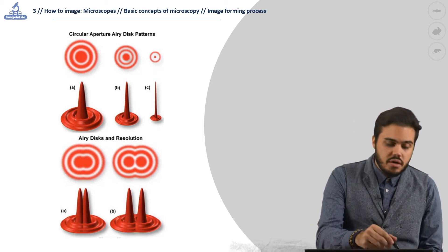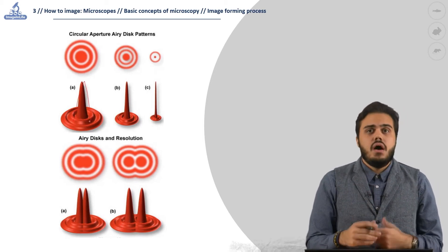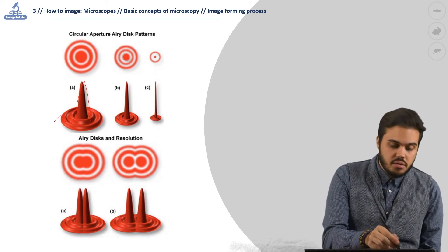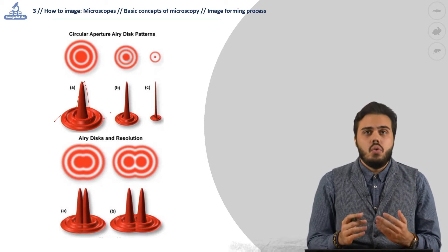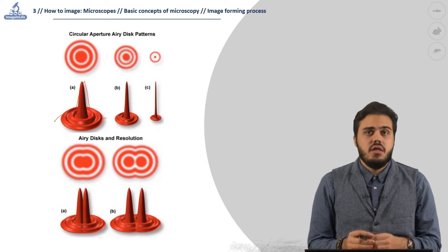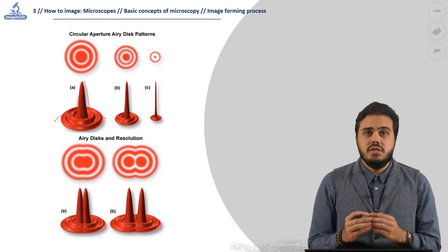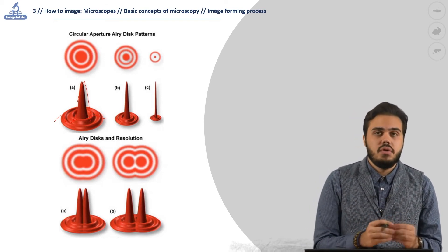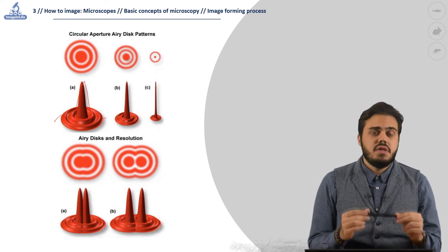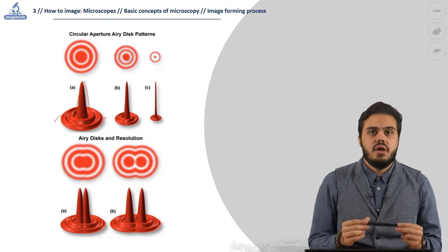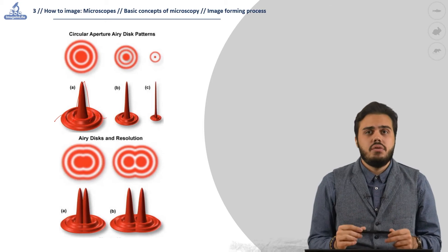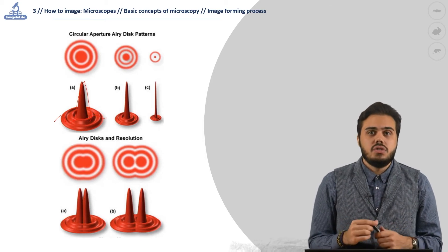Each and every dot represents a detail of the specimen and is formed by an Airy disc. The Airy disc is a spike of intensity with waves or rings of intensity around it. The lower the optical aperture, the bigger will be the spike. If each spike is a detail, the bigger it is, the more they will overlap, merging and destroying the difference between them. To avoid this, it is better to keep in mind that a low wavelength and a high numerical aperture allow for a smaller and better defined spike, and so a better resolution.